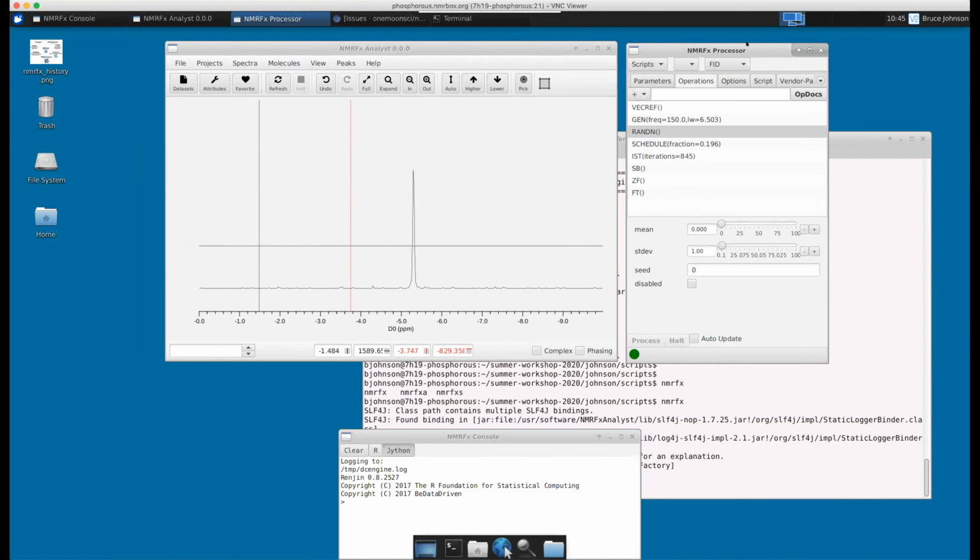Bruce, if I could just add a couple of notes on the theory. All these iterative algorithms are more or less ad hoc approaches to something that minimizes the L1 norm. The fixed point of most of these algorithms is the L1 norm. And it turns out that if you actually get to the fixed point, you introduce a new set of artifacts that have to do with non-random baselines, somewhat independent from the artifacts that come in from the sampling schedule.